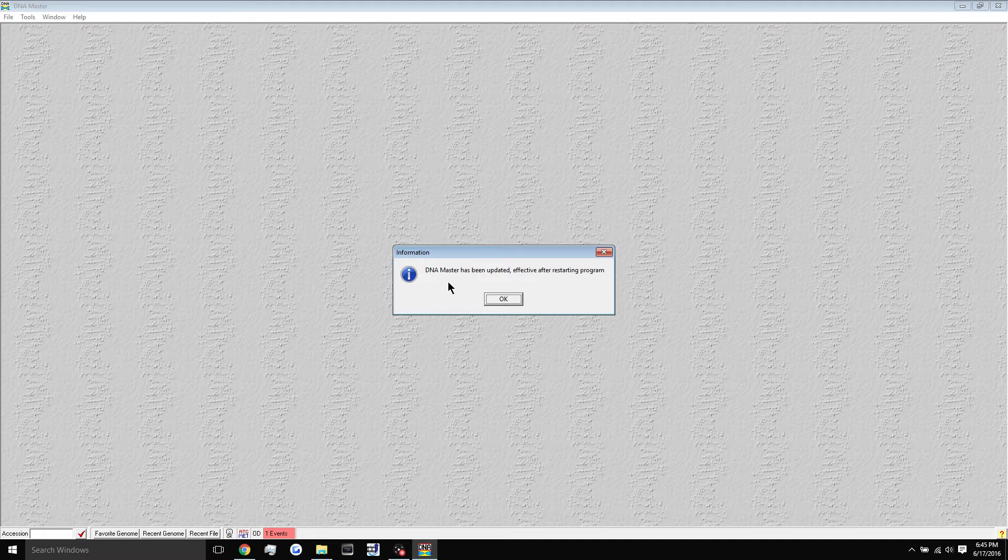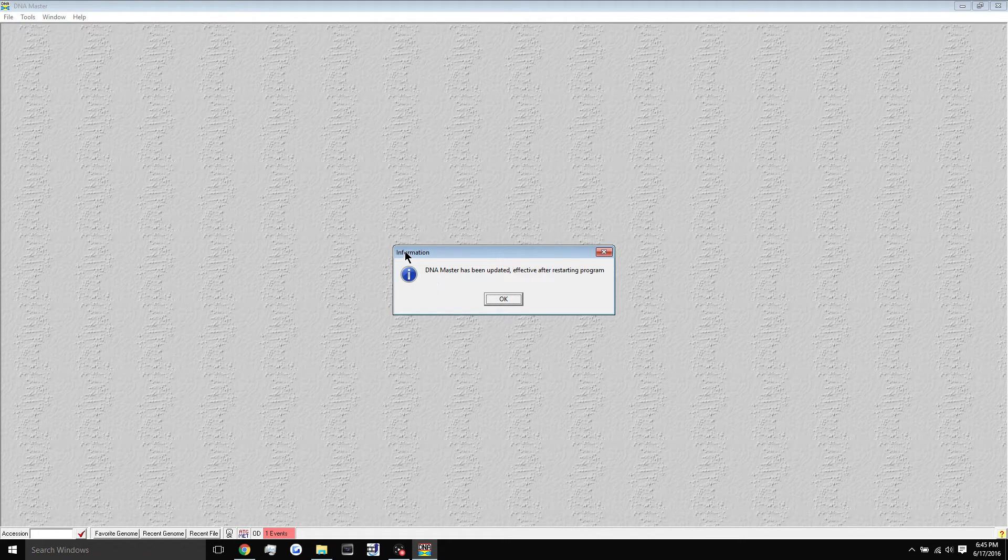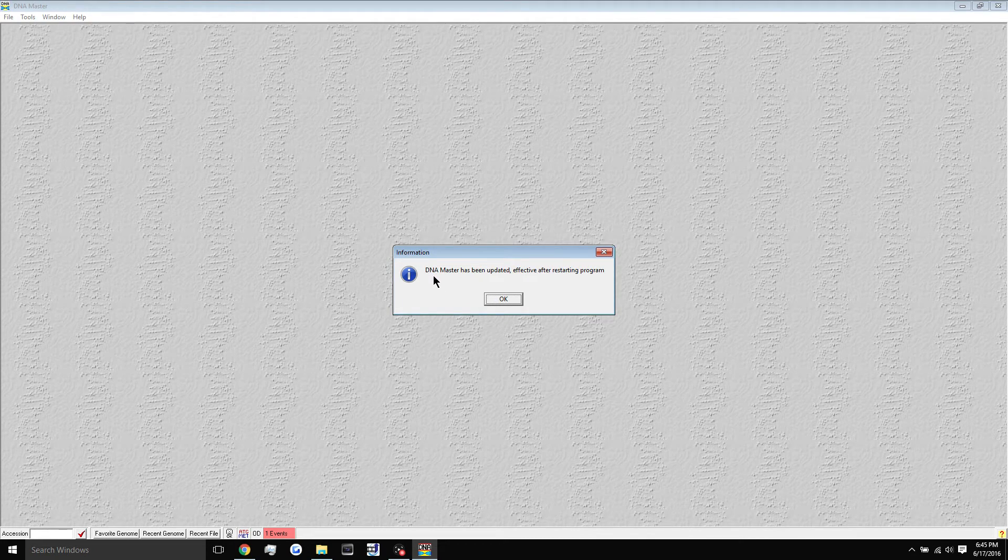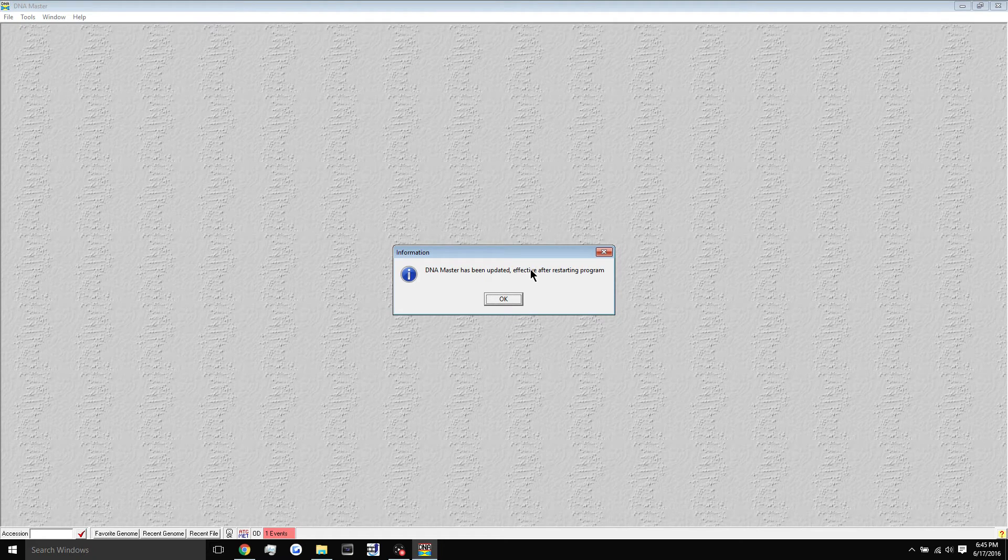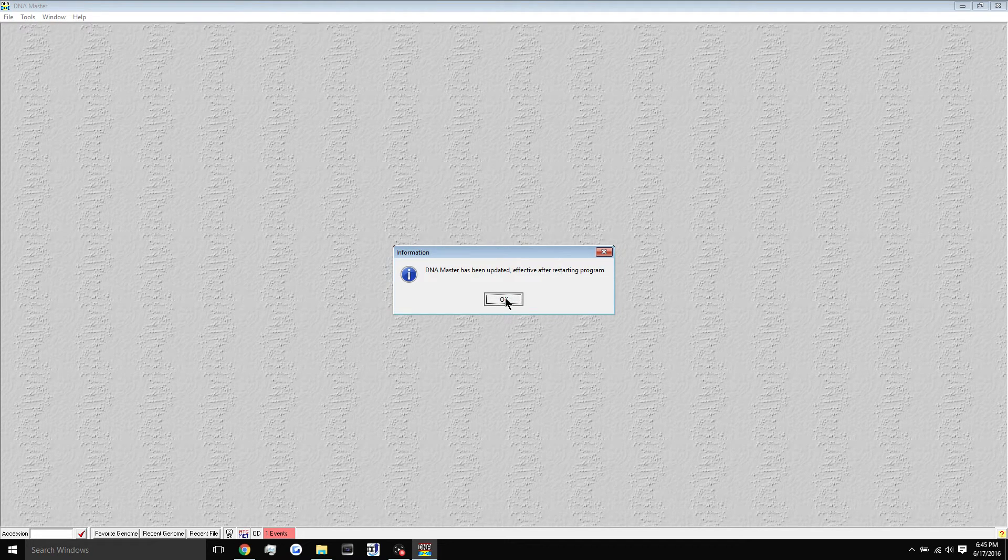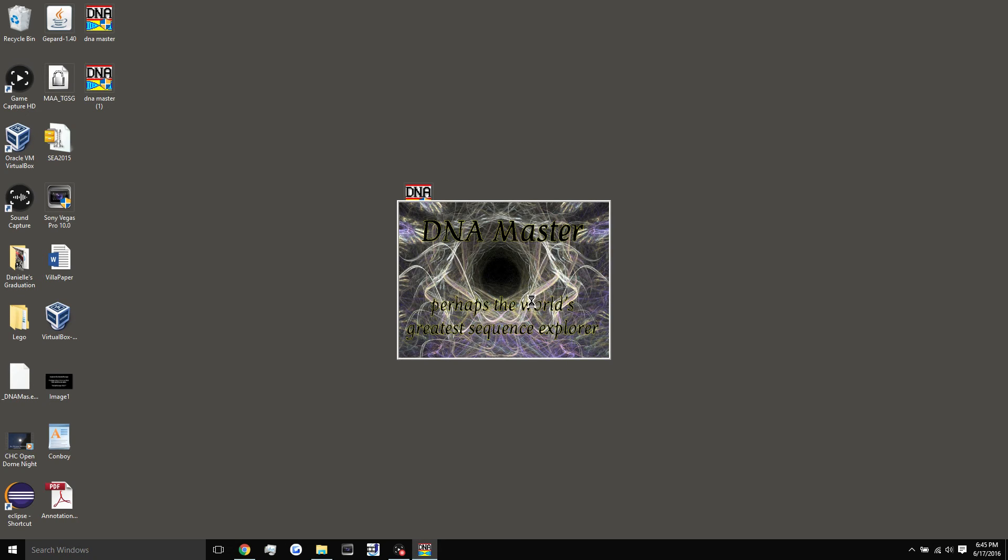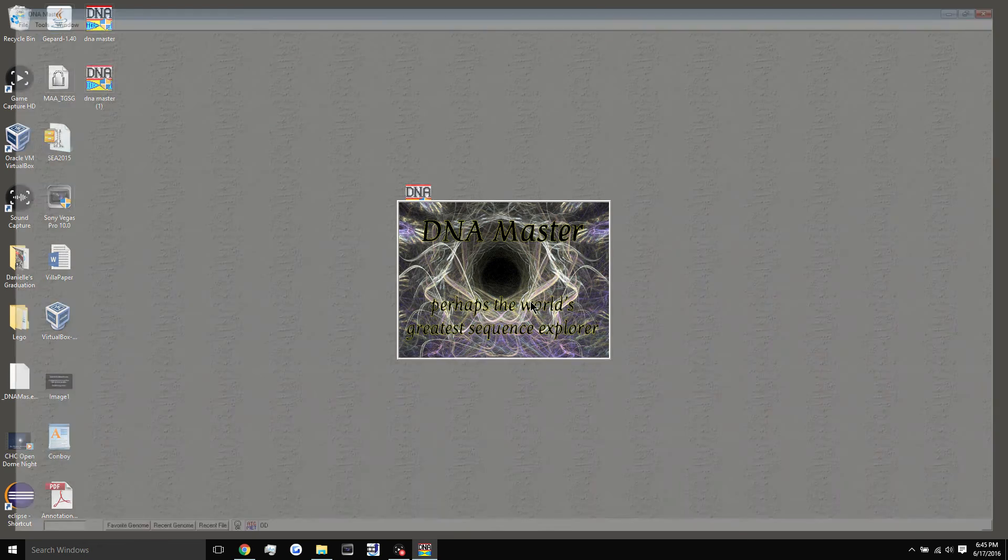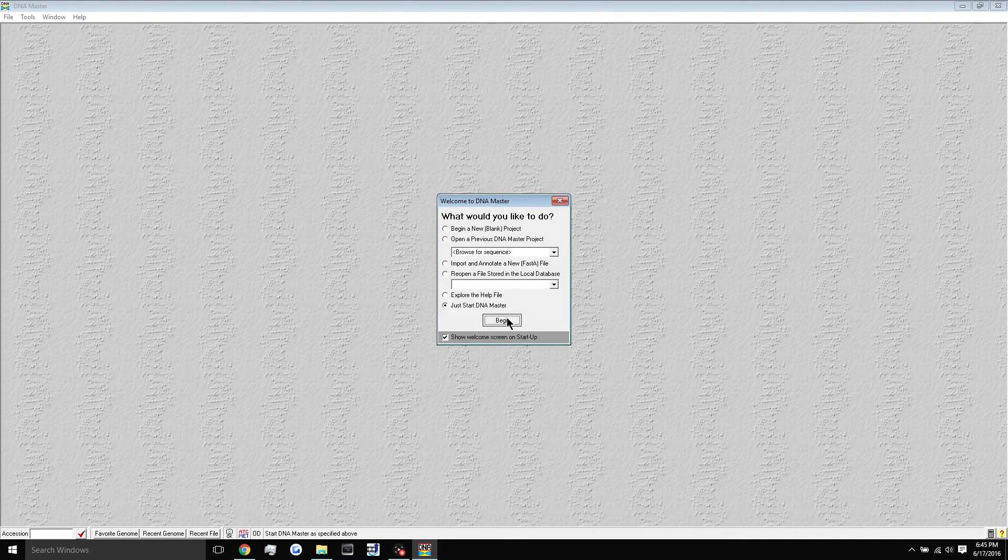You're going to need internet connection, and as you can see here, it says information DNA master has been updated effective after restarting the program. So simply do that if this is the first time, and when we go back into the program, you'll now have the most updated DNA Master file, which will be good to go for loading in your genome and everything like that, which I will show you in the next tutorial.